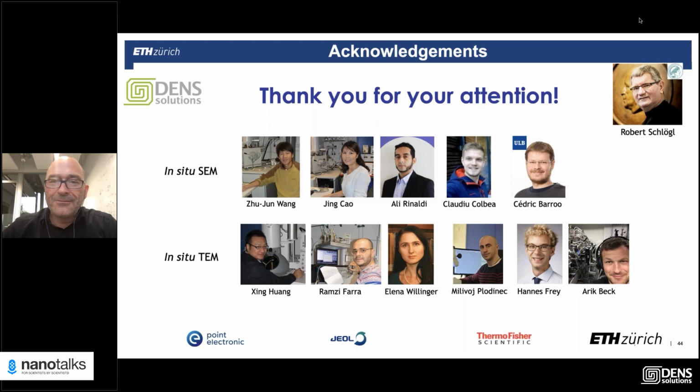Yes, this is Yuan Yuan Zhu from University of Connecticut. Thank you for the fantastic talk. I posted a general question, but maybe I can ask a more specific one. It was fantastic to see your operando data pinpoint that the highest conversion of water is at the transition state between the metallic phase and oxide phase.